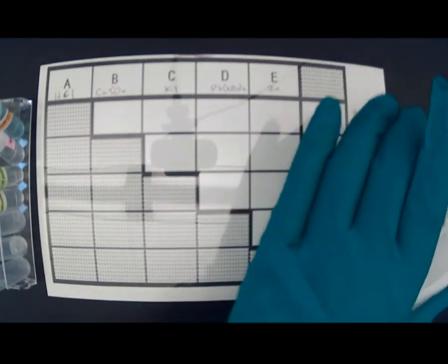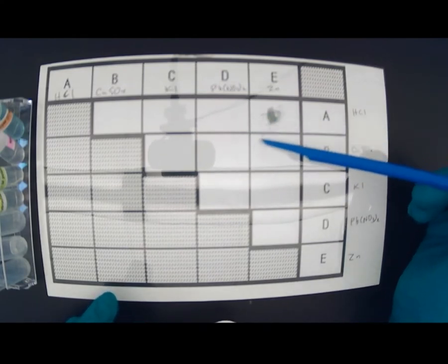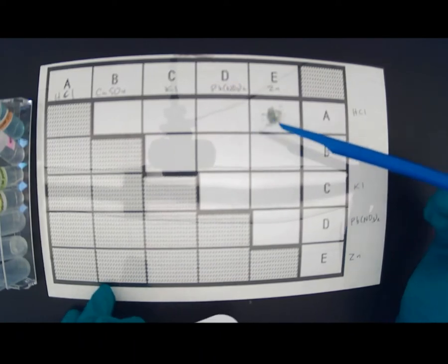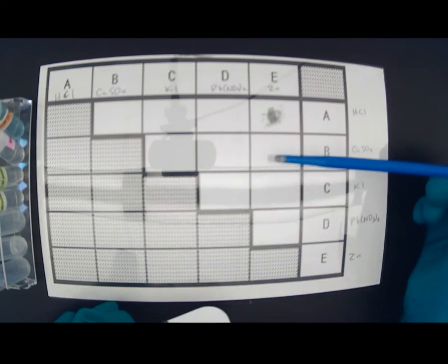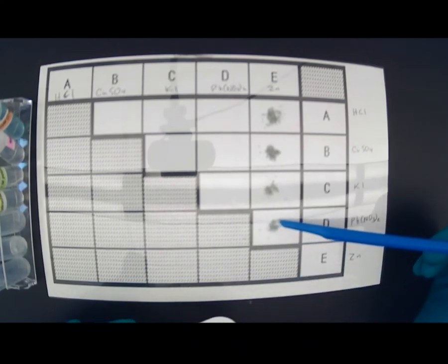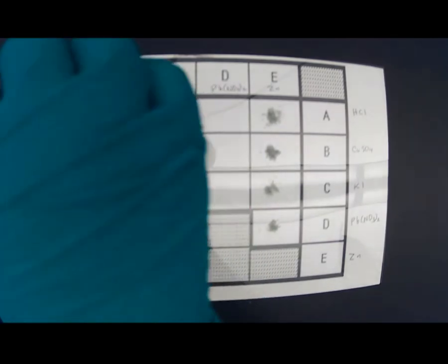I'm going to start with the zinc because I found that it works best when you put the reagents on top of the zinc instead of putting the zinc on top of the reagents. Otherwise the chemical reaction is happening at the surface underneath and you can't really see it very well — a lot of students said they couldn't see anything. When I put the zinc in first, I could see all the reactions happening. By the way, some of these are not going to have any reactions, so you'll be able to recognize that as well.